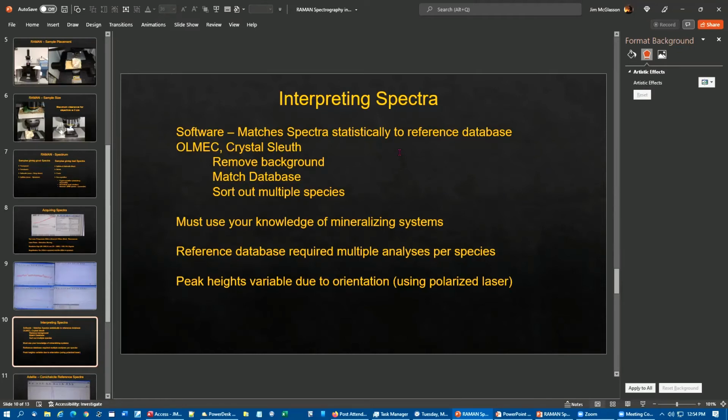You get multiple species when you have a transparent mineral. A lot of times, if you don't take that crystal off and are trying to do it on a specimen without damaging a crystal, you get whatever's behind it as a partial spectra as well.